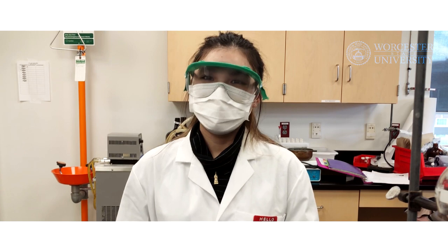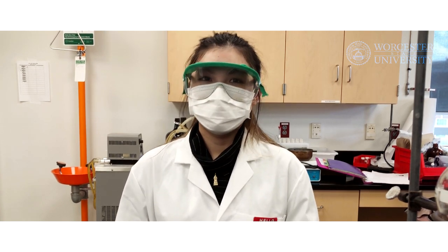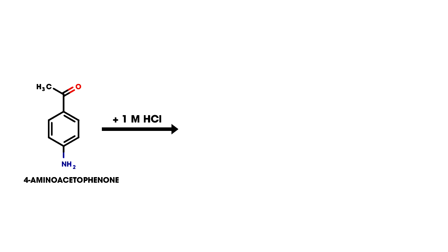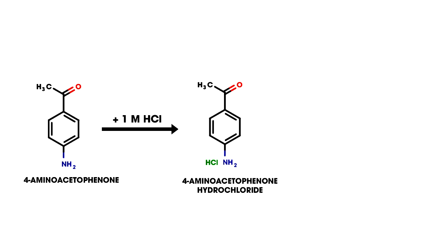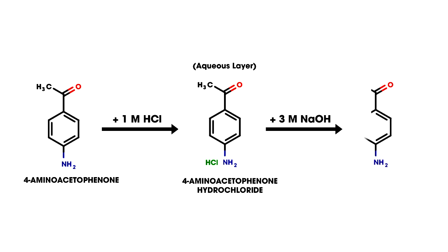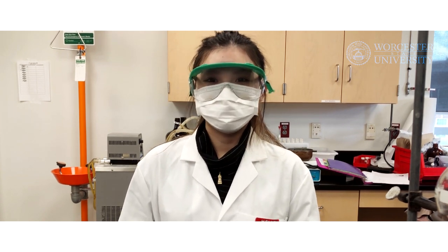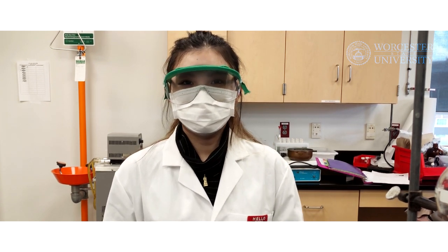For the first extraction, we will be extracting 4-aminoacetophenone from the ethyl acetate solution by reacting it with 1 molar hydrochloric acid to form its salt, 4-aminoacetophenone hydrochloride. This will allow the salt to be extracted in the aqueous layer. Then, we will return the salt to its original form using 3 molar sodium hydroxide. Make sure you have an Erlenmeyer flask beneath the separatory funnel to receive the aqueous layer before you start.